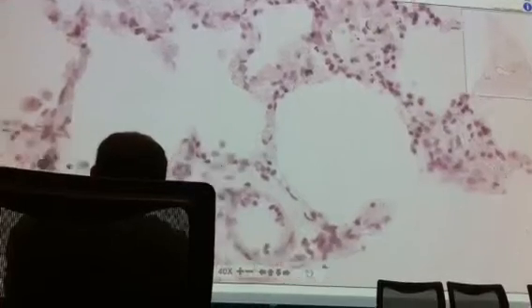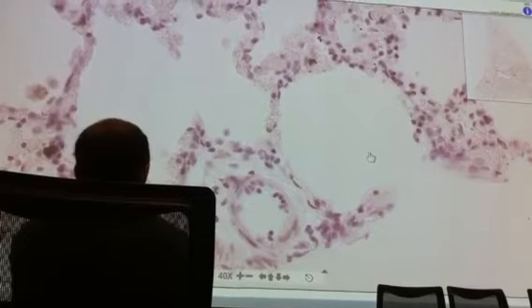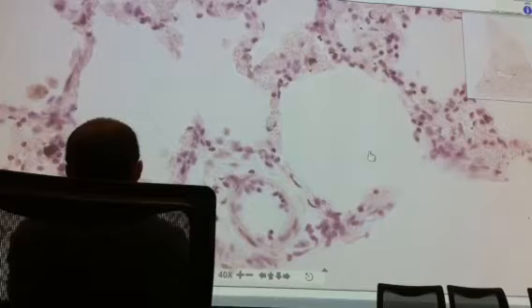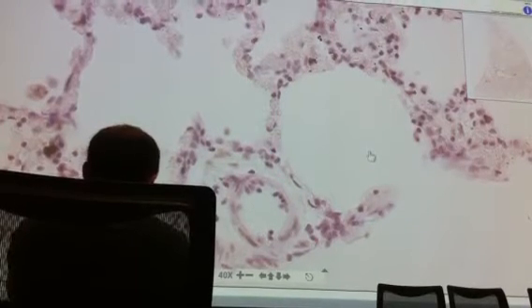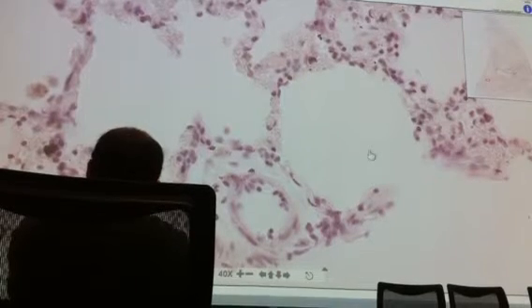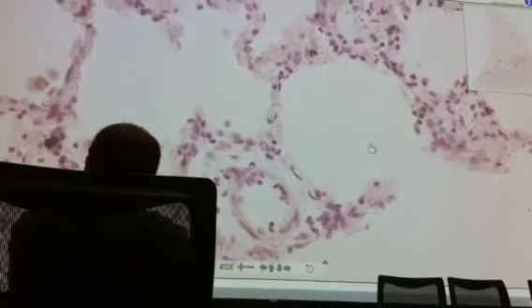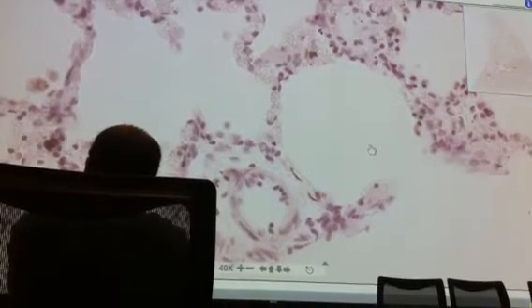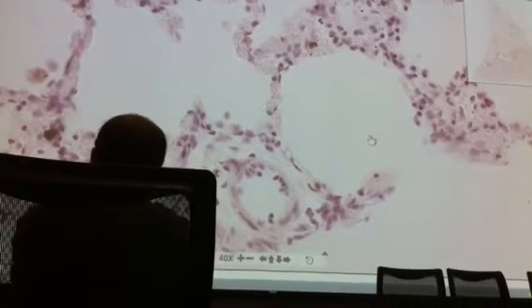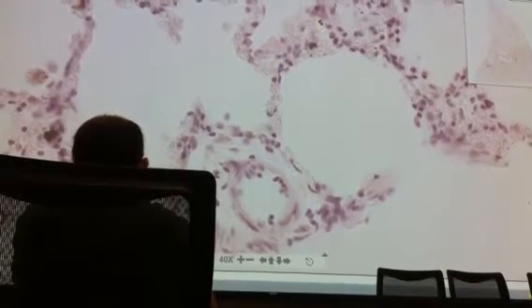And again, make sure in all of this stuff, you're not going to be able to identify every cell. So just look for the typical cells with the typical features and be able to identify those. On this test, we should ask you typical looking structures. We're not asking you to identify pathological things. We're not asking you to identify everything. But if you can identify the typical ones, you'll be fine. Okay, so just go for that. Don't worry about doing everything.